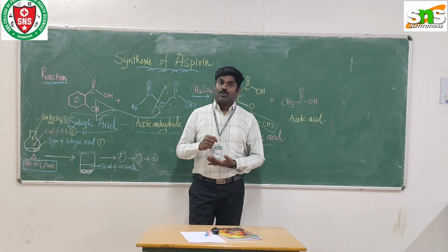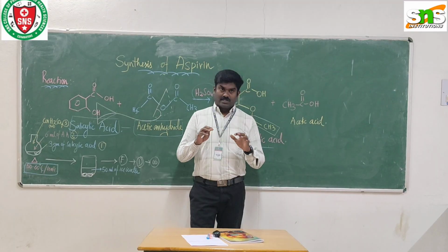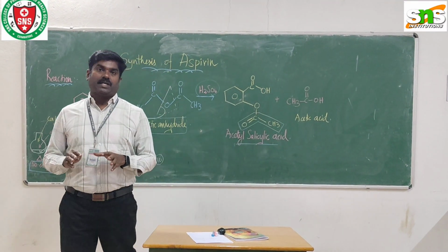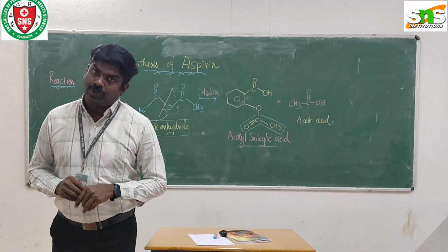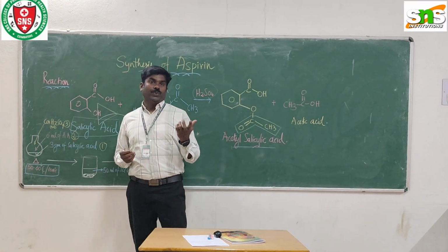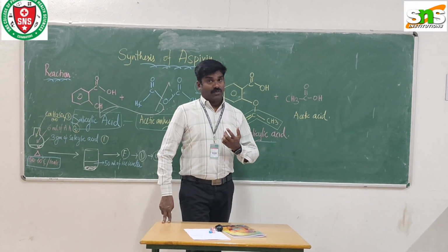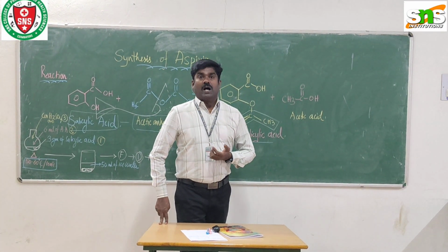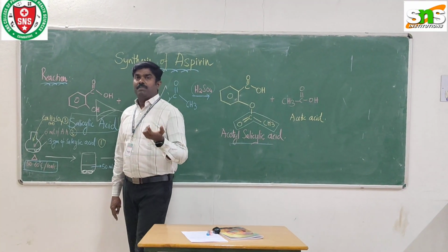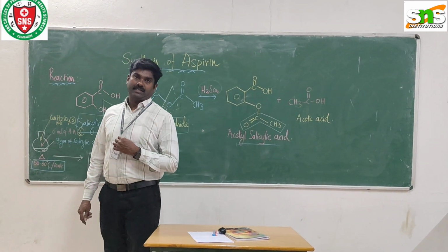Then we dissolve it properly with the help of a glass rod, stir it around the entire watch glass, and dry it for 3 to 4 hours. After drying, you can see the pure crystal form of acetylsalicylic acid. If you find any foreign material or any color change, we can easily confirm that some other impurity was present in the acetylsalicylic acid.